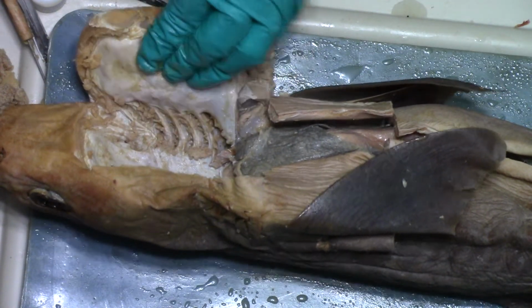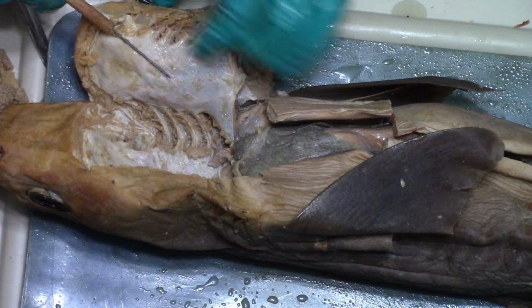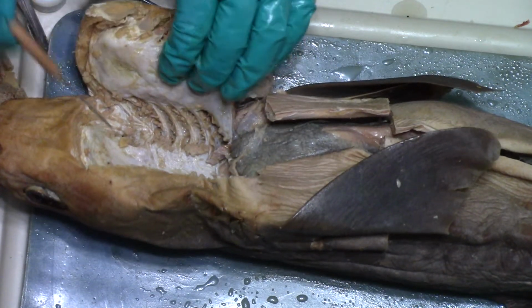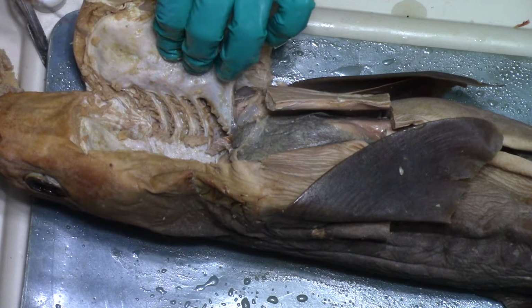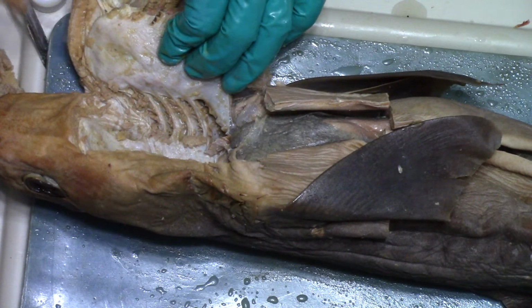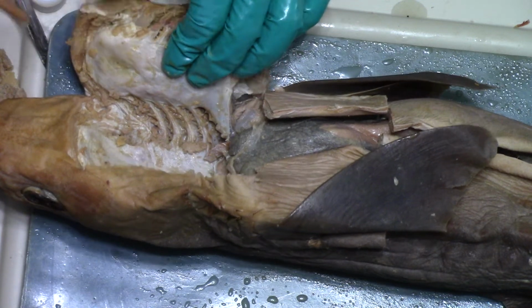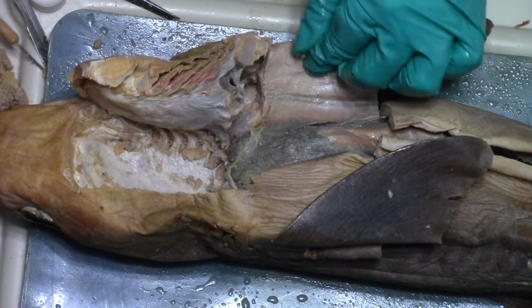This is the tongue on this side. It's very, very hard. You can see it's not much of anything. The roof of the mouth, and you can see all the teeth that they're famous for. This is a small shark, so it doesn't have a lot of teeth. I'll do a zoom close-up of that later.